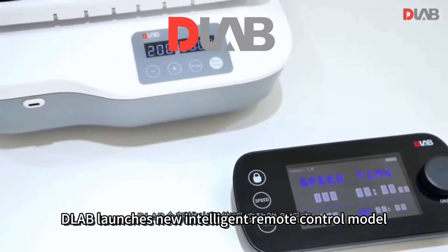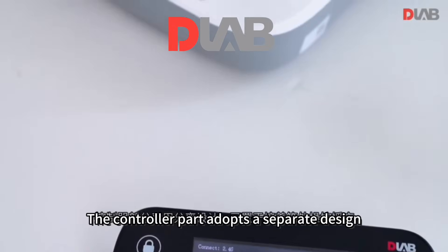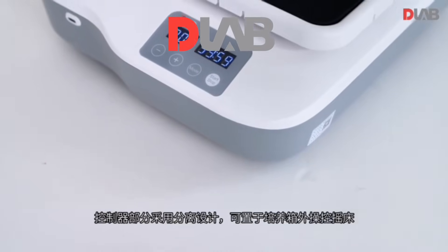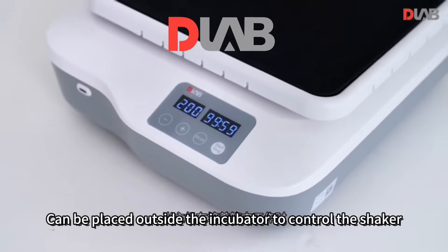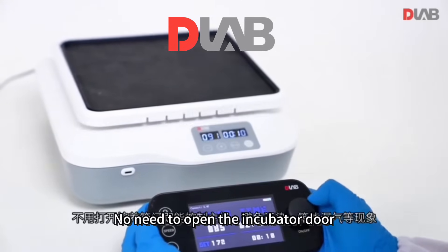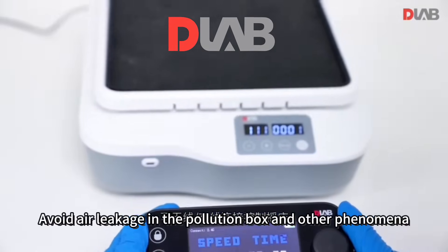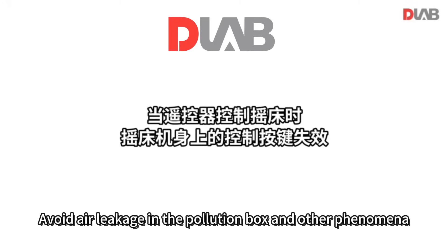D-Lab launches a new intelligent remote control model, the Drake Shaker. The controller part adopts a separate design and can be placed outside the incubator to control the shaker. When the host is working in the incubator, there is no need to open the incubator door to control the mainframe, avoiding air leakage, contamination, and other such phenomena.